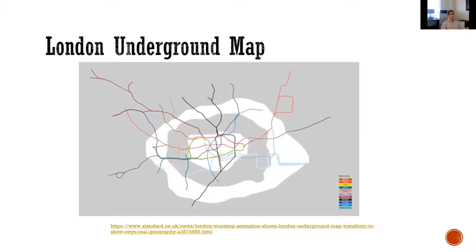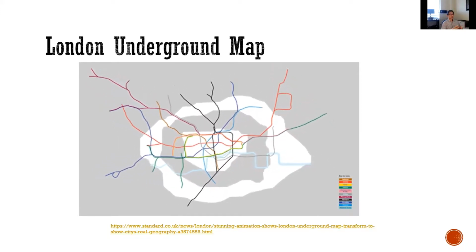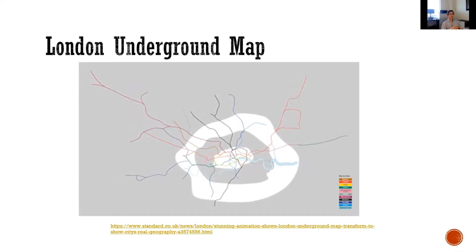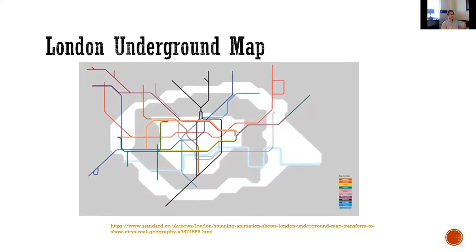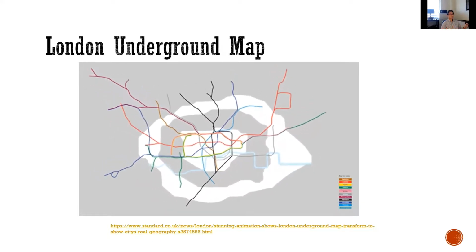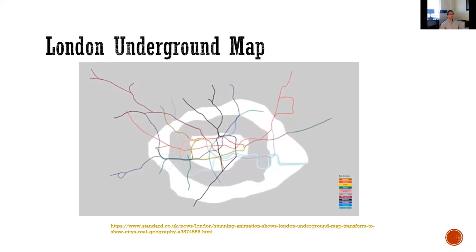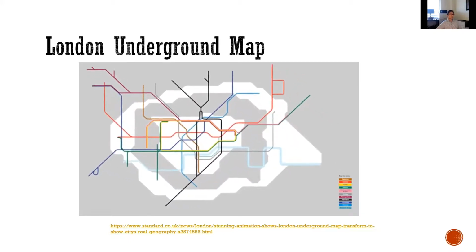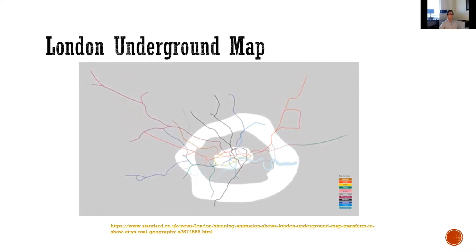With PCA, you will get a very crowded layout of your cells. However, you want to do the transformation to spread them out, the same idea as this underground map. So the transformation is done by tSNE.